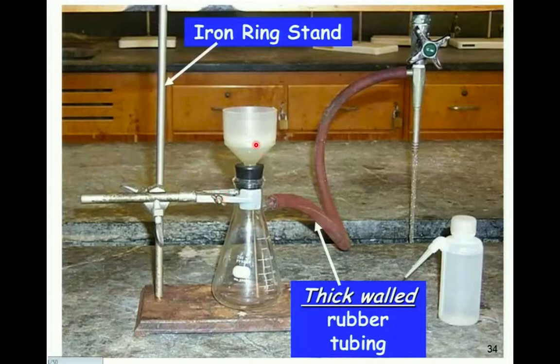This is basically the setup, although in our new building we are a little more sophisticated than this. You want to clamp your filter flask. Your filter flask is going to run into a secondary container, and then that secondary container, called a trap, will attach to an aspirator that's in the wall.